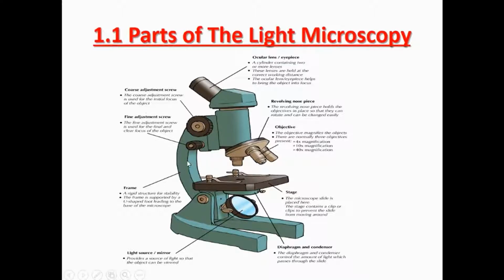And then right here is the frame. Just a frame. Remember learning about frames in technology. This is that frame. This is a rigid structure for stability. And like I said, this is the stage. This is where the microscope slide is placed.